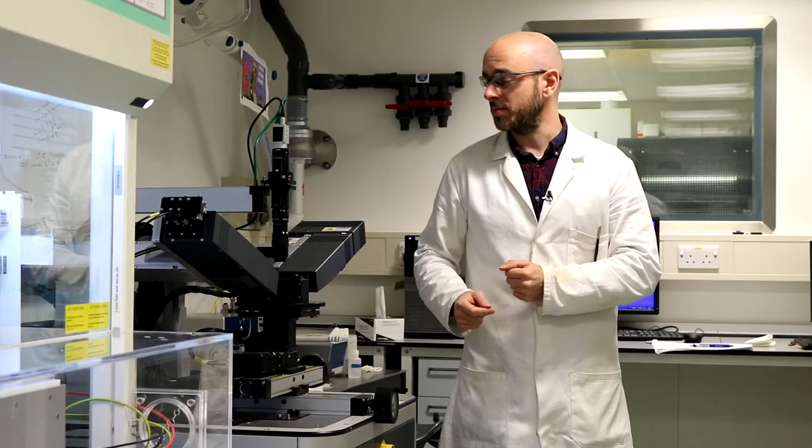Today I'm going to show you how to use the Semilabs SE2000 spectroscopic ellipsometer with environmental porosimetry module.